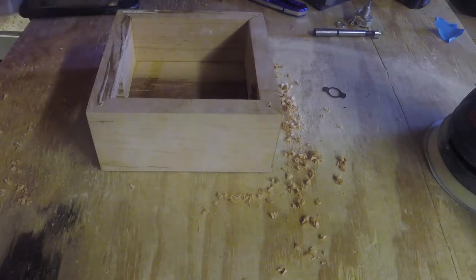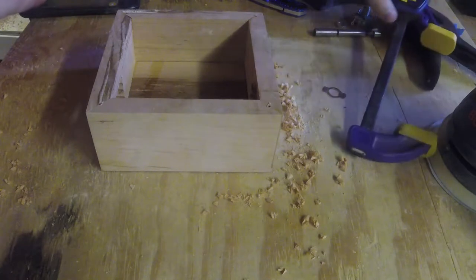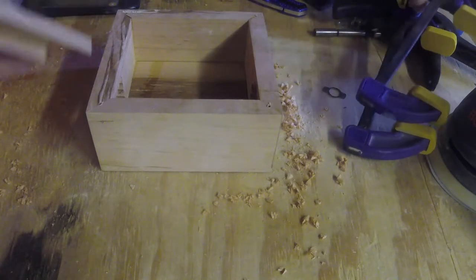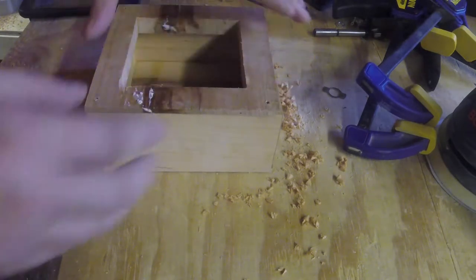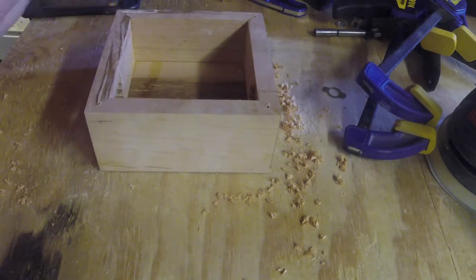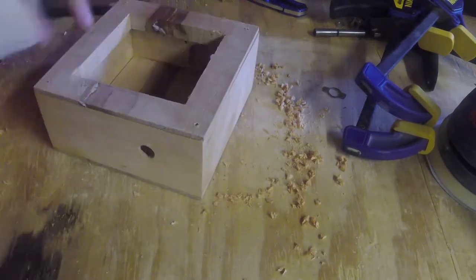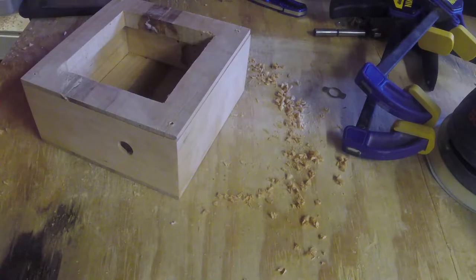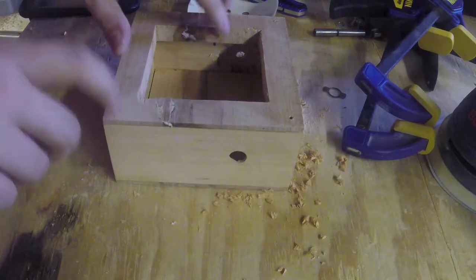Okay, so what we're gonna do. Okay, we've got this guy, C-clamps. A little glued on, but it's all right. Honestly, this is gonna stay on 99.99% of the time. But I wanted it to be able to come off in case the wiring is wrong or something. Okay, we mostly got it. Okay, so the next step is probably to glue the plastic on the top.